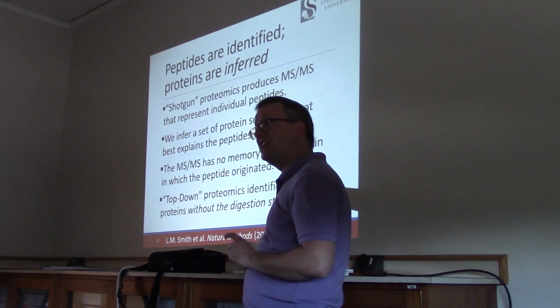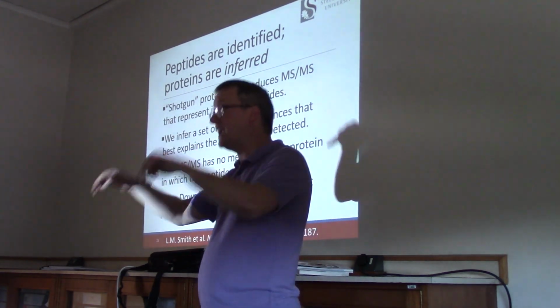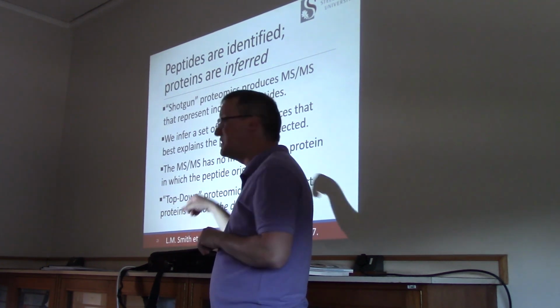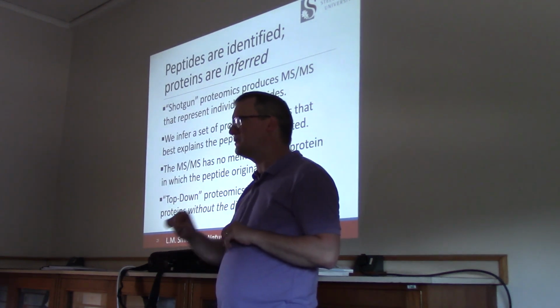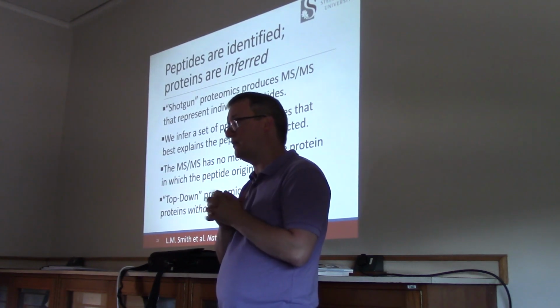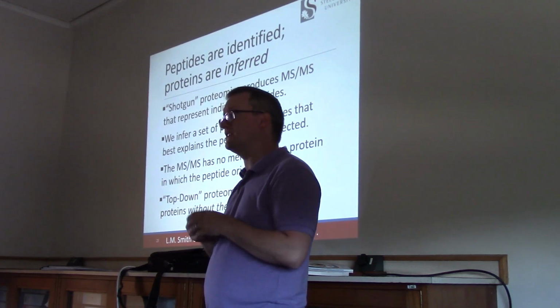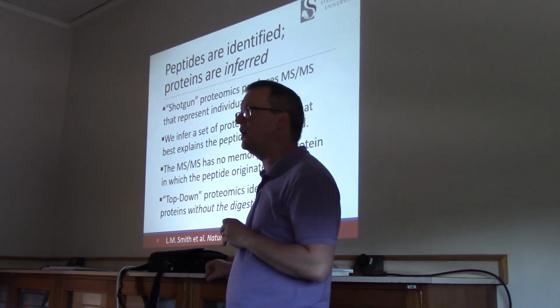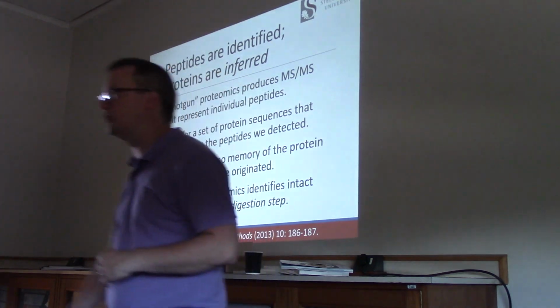If you are interested in understanding which, for example, phosphorylations appear together on a particular protein sequence, you'd probably better use something like top-down proteomics. I'm not aware of a lab in South Africa at this time that's doing top-down, but there's a consortium for top-down proteomics based out of Evanston at Northwestern University in the United States that does some really amazing work in this space. Lloyd Smith and friends published a really good paper introducing the term proteoform to help explain how this technology works.